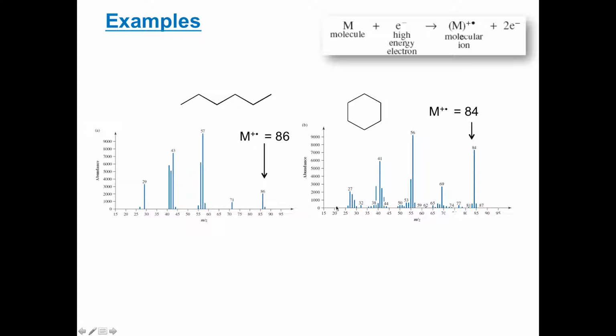So there are a few other things to note with these two mass spectra. First of all, there's a bunch of other signals here at lower mass values. And that's because under the extreme conditions of electron bombardment, often the molecule will actually break up into fragments. And so you can see those lower molecular weight fragments appearing also. That's why the one on the right-hand side is the most interesting one, because that's the occasion where the molecule survives intact through to the mass analyzer. So the fragmentation pattern is one thing to note.